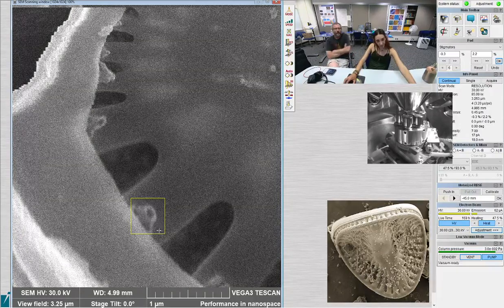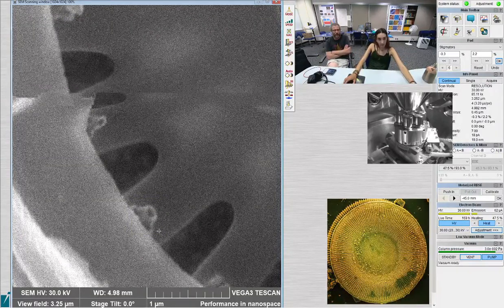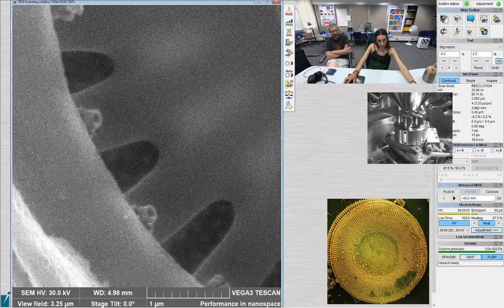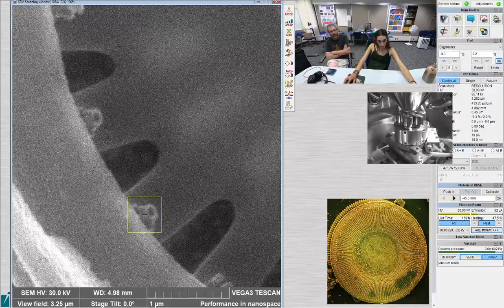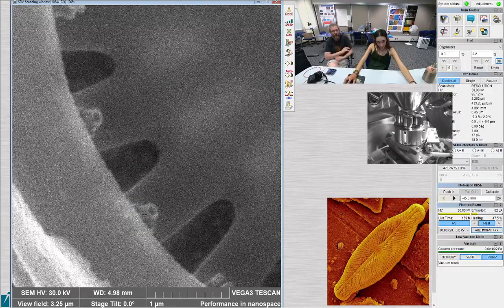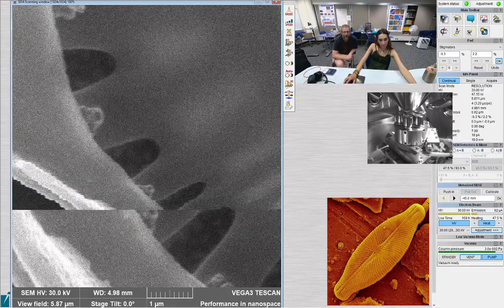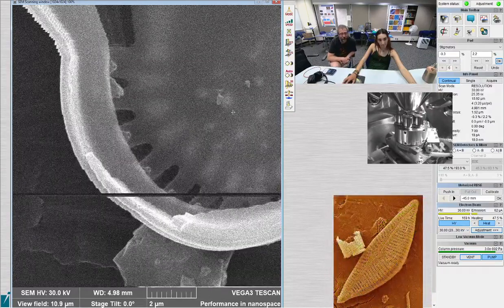It depends on what you think of as a species, but for most diatoms, species is determined by their skeletal structure. Possibly that's not a good idea, but it's still what we've been doing. And definitely for the fossil world, that's how we do it, so we don't have anything else to go by.